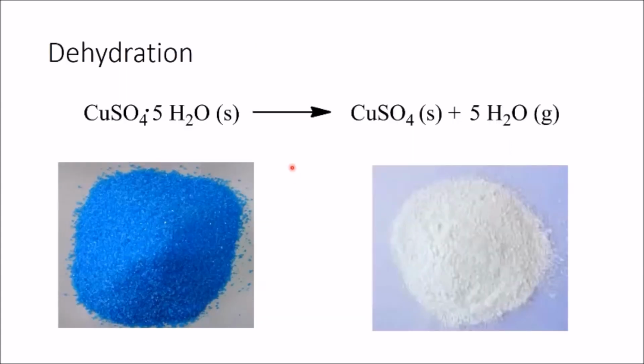Once you have the mass of 3 clean and dry labeled test tubes, you're going to want to add approximately 0.3 grams of hydrated copper 2 sulfate to each tube. It's very important that you do this experiment in triplicate and that you do the same thing to each of the 3 test tubes at the same time. If you were to do them one at a time, it would take far too long.